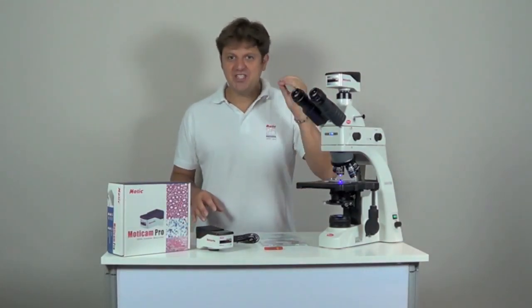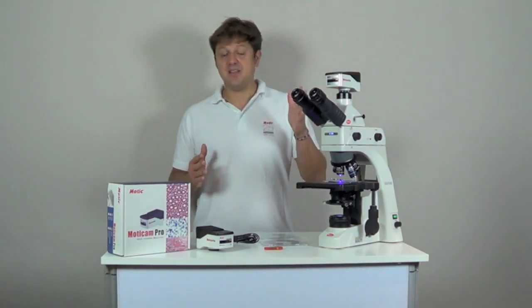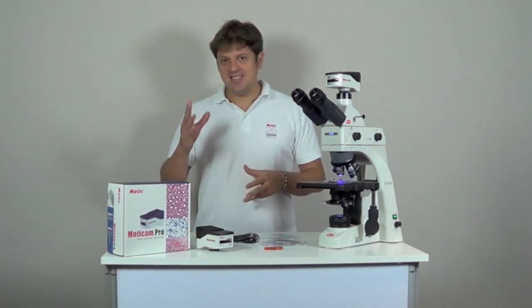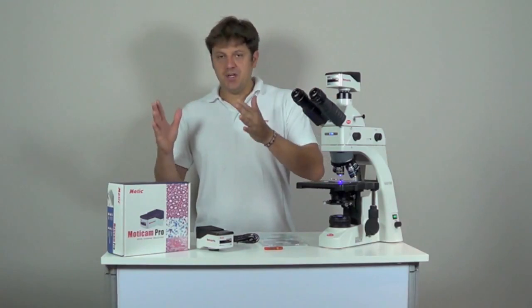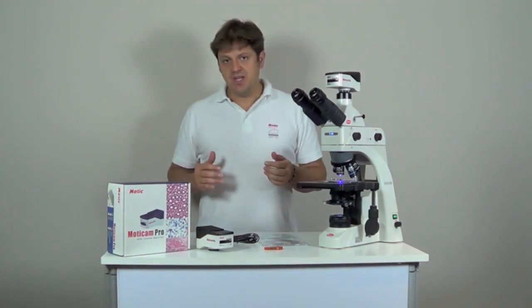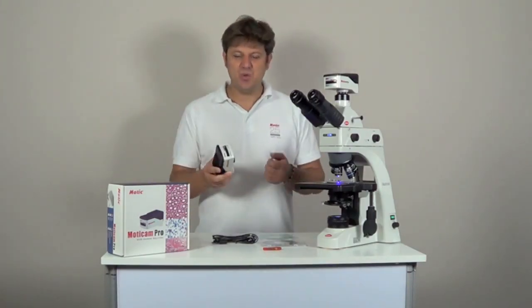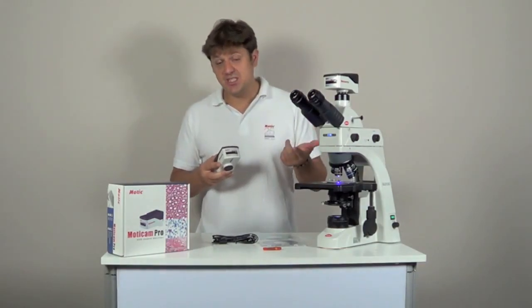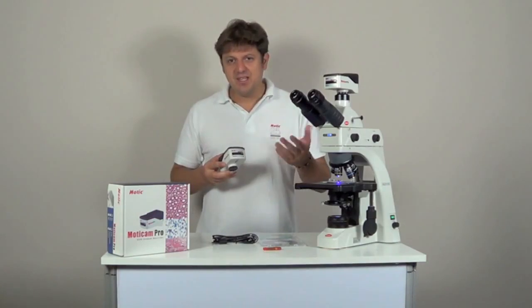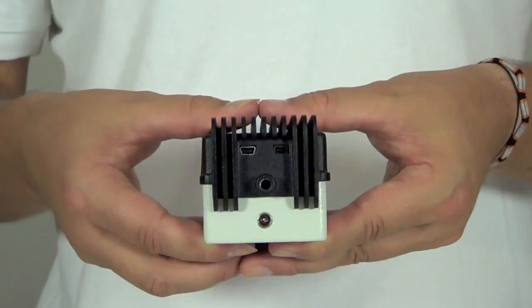Maticam Pro are cameras with a professional CCD sensor for advanced image quality requirements. There are four ranges: 1.4 megapixels, 3.2 megapixels, 5 megapixels and 1.4 megapixels high speed. The high speed camera has a sensor with bigger pixels that can absorb more light. Most of the models have the choice between color or monochrome image and with or without Peltier cooling. All Maticam Pro cameras have a Sony ICX CCD sensor with high light sensitivity, and the optional Peltier cooling system is necessary to protect the sensor from noise generated by heat, especially when the camera is used for long exposure times. All cameras are connected to the computer with a USB cable and there is a trigger port for capture control with an external device.